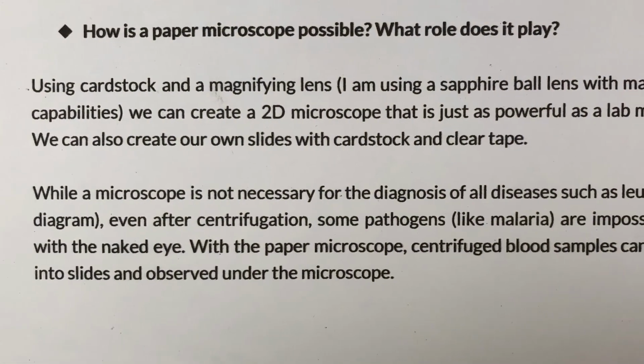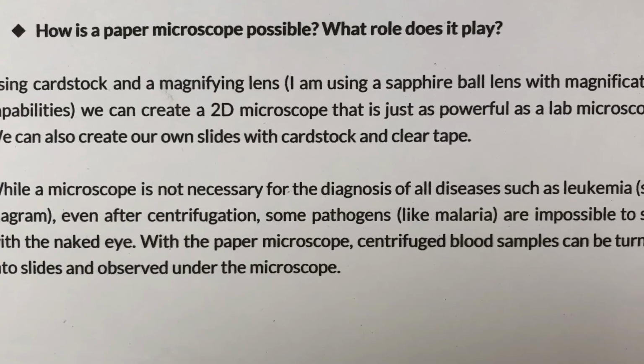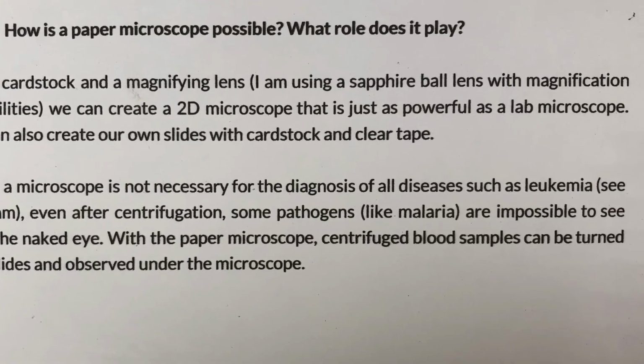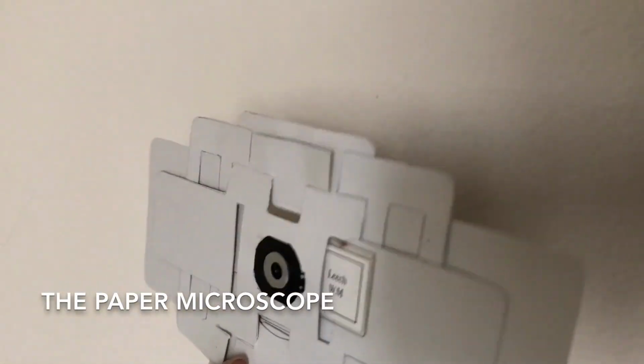The microscope is another key element in the identification of pathogens. However, much like the centrifuge, it costs too much to be used in rural areas. But using cardstock and a magnifying lens, I used a sapphire ball lens with magnification capabilities, we can create a 2D microscope that is just as powerful as a lab microscope.